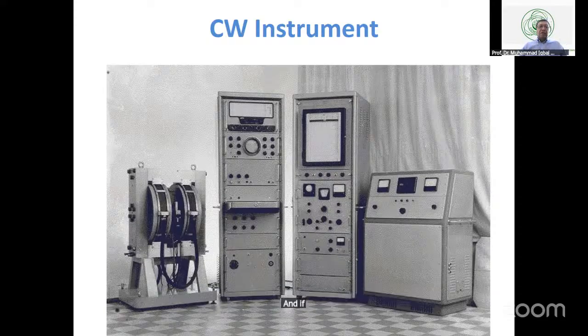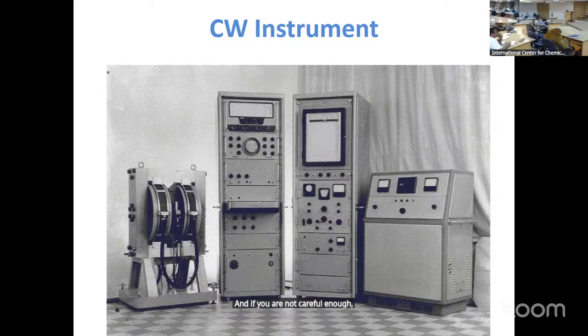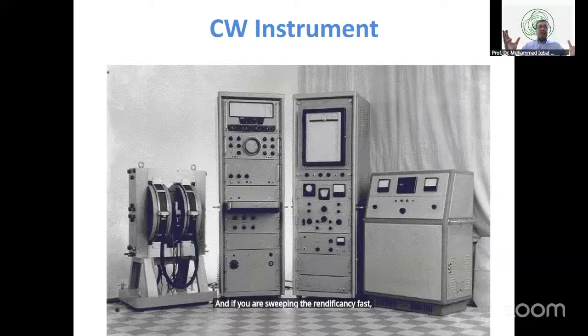And if you are not careful enough, and if you are sweeping the radio frequency fast, then you miss it, because it just goes back and forth, and you just have a distorted NMR. Extremely slow technique and insensitive technique, because it's time inefficient. It takes so much time.